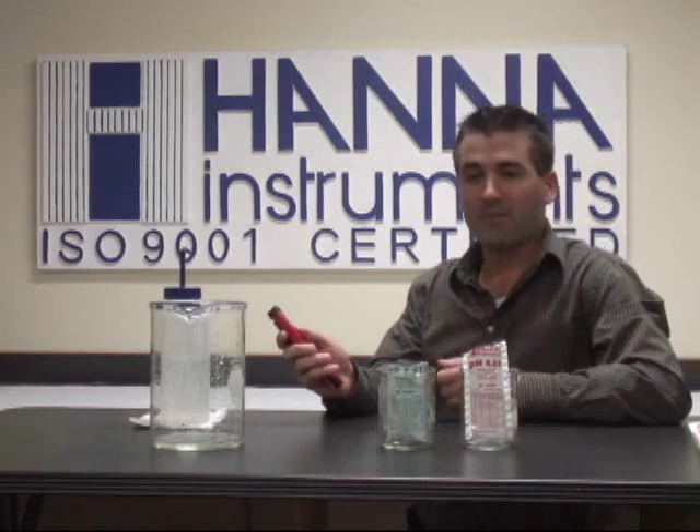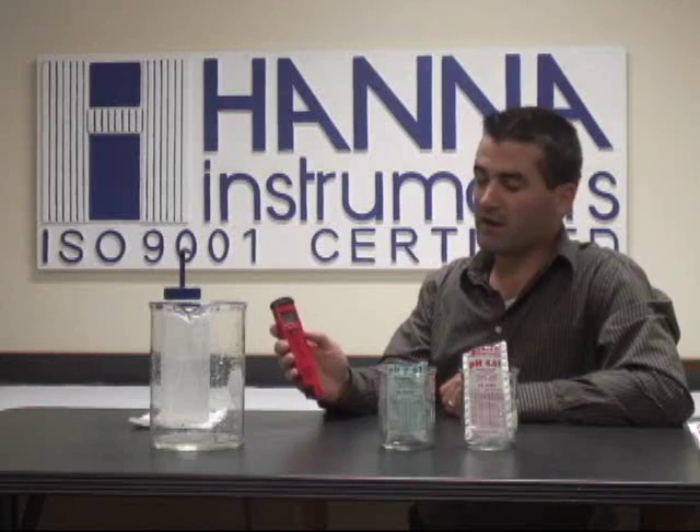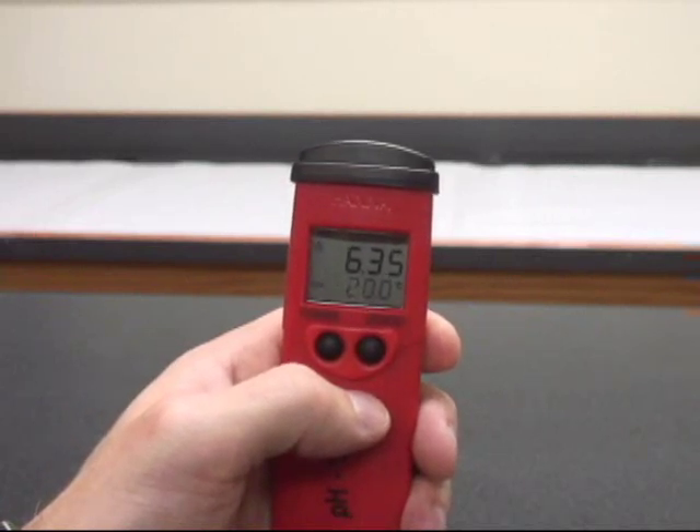Very simple. We're going to pull the cap off and turn the meter on. Once the meter has turned on completely and the LCD screen has loaded and is in the measurement mode, we'll begin.